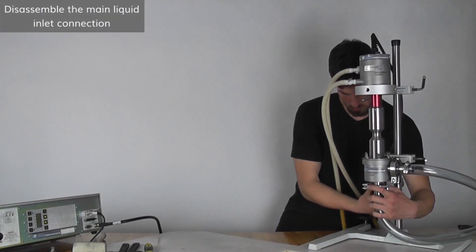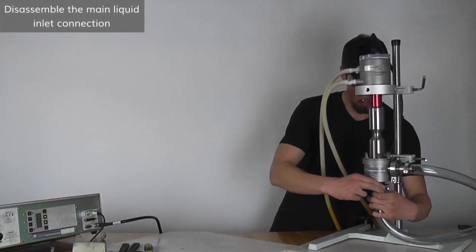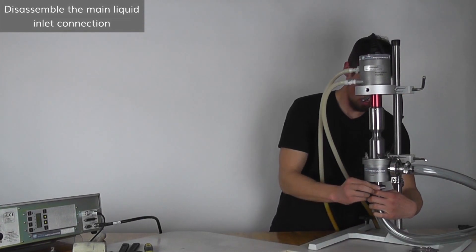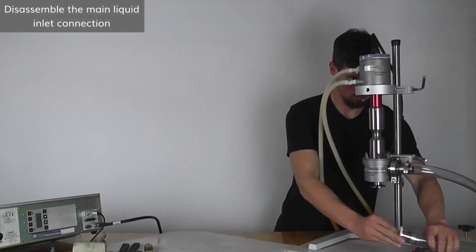Make sure there is no liquid in the main working liquid lines. After that, disassemble the inlet and outlet connections by removing the clamps, gaskets and hoses.